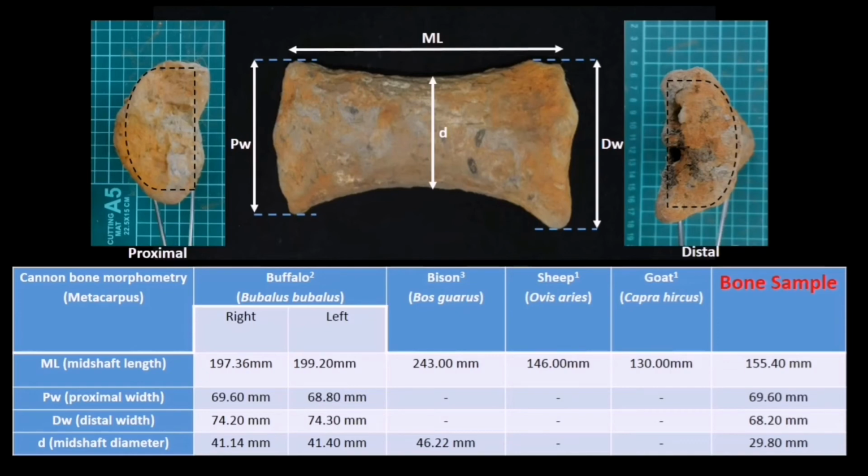Actually, if I would say that this is a cattle sample, I'm assuming this is a cattle sample, be it a cow or a bull. It also depends on the breed itself. If they are from a large breed, like the Limousin, the size could be bigger, probably similar to buffalo.